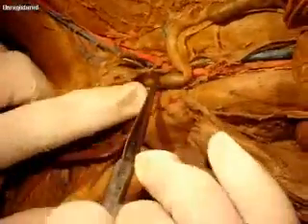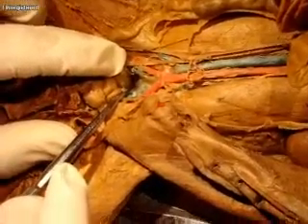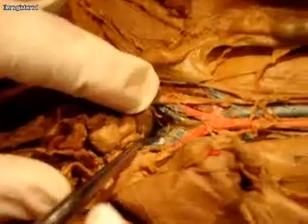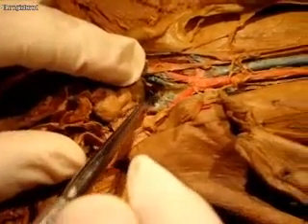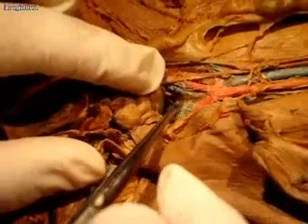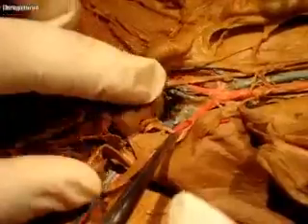Then if you look in the very, very middle, right here, you can see it. See right here where I'm pointing? Can you see that on the camera? There's a little tiny blood vessel, artery and vein that go straight out. Those are the median sacral. Do you see them? They go straight down from the middle. These are the median sacral arteries and veins that are referred to up there.